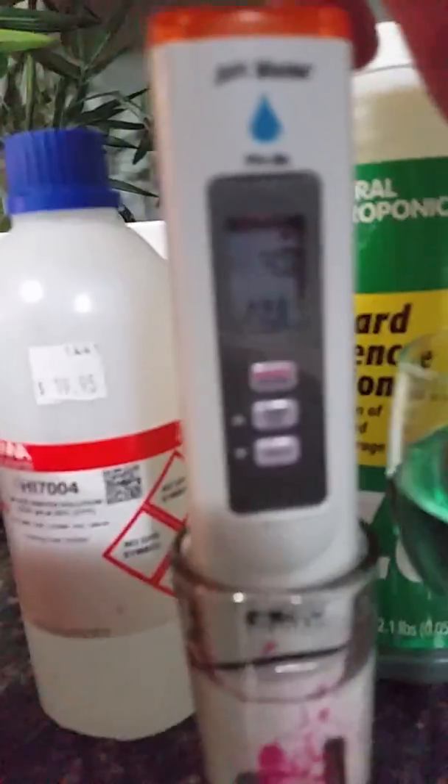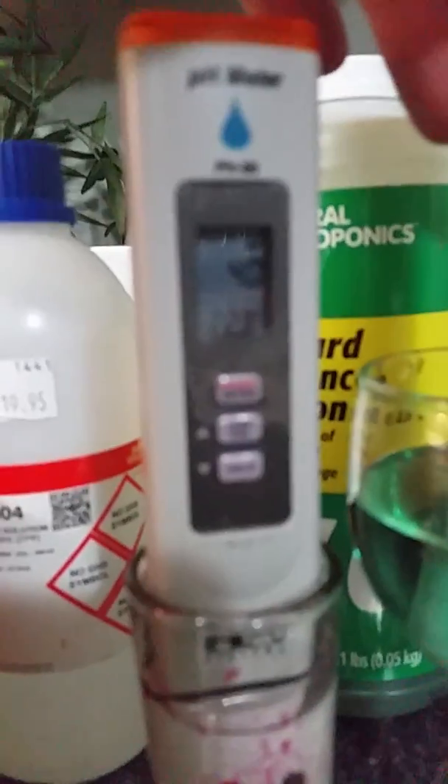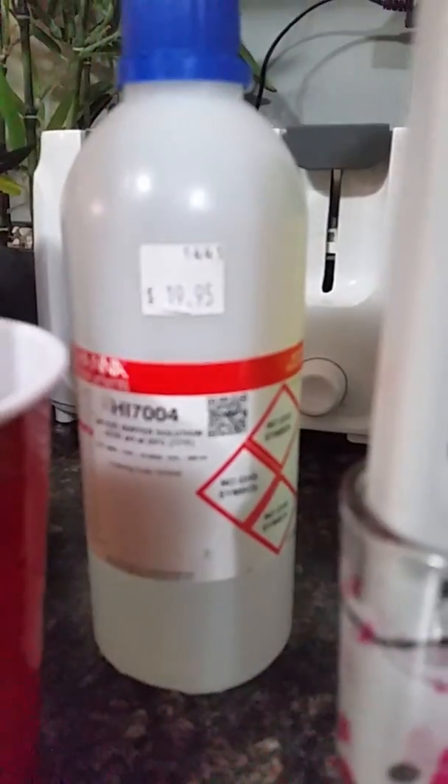I already know she's set up for four. This is another meter, but I already had these set up. You do the exact same thing and then you rinse them off well with a bit of water.